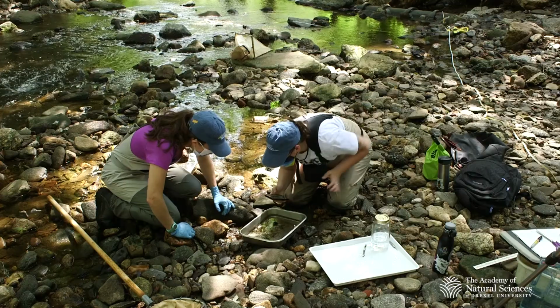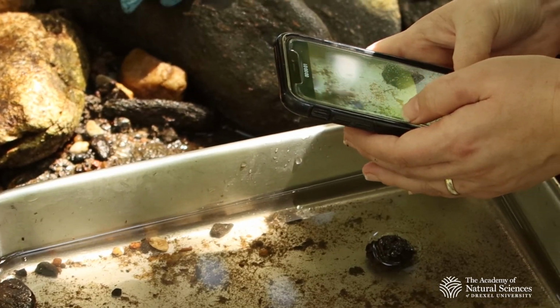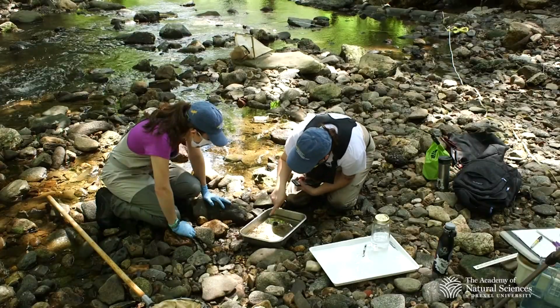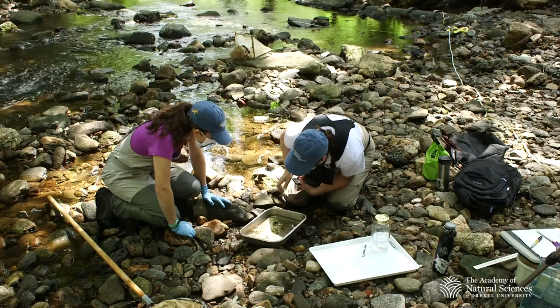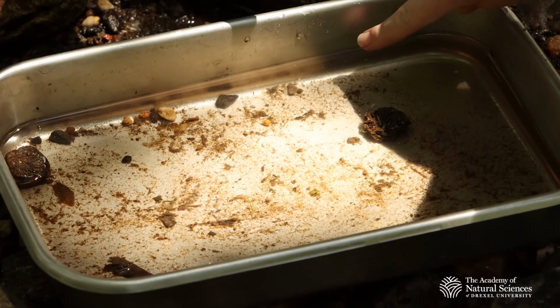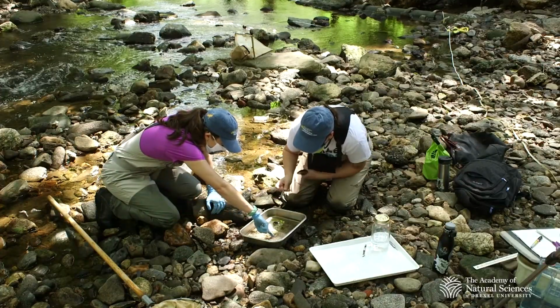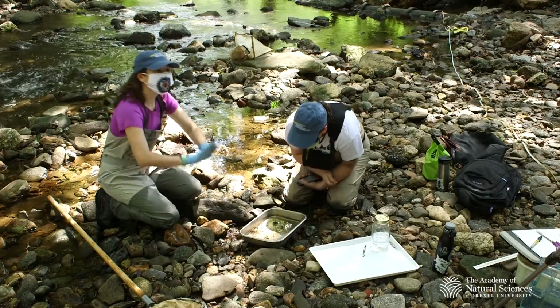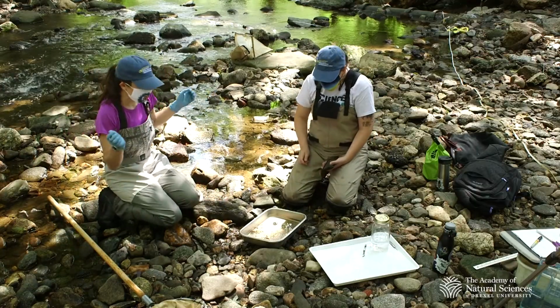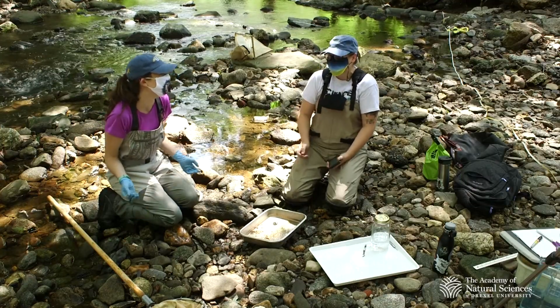Let me see if I can get closer. I can't tell from here. I thought so, I saw small 3 tails. Look, there's another one there. I think I see... 1, 2, 3. I think I saw some kind of diptera in here, just based on the movement. Oh, is that a black fly right there? Yes! Everything's really tiny. So there is excitement in this pan, but you probably can't see it.